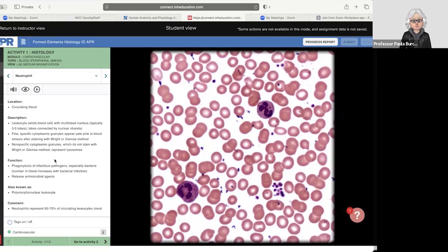But another thing that you need to know with all of your leukocytes is that you're going to have 2 main groups of leukocytes. Those with granules, and granules are structures that store different types of chemicals. These are chemicals that they're going to use when they're trying to get rid of a pathogen or carry out their immune response. So if the granules are visible when you stain the cell, and you can see it's kind of grainy here, these cells are going to be called granulocytes.